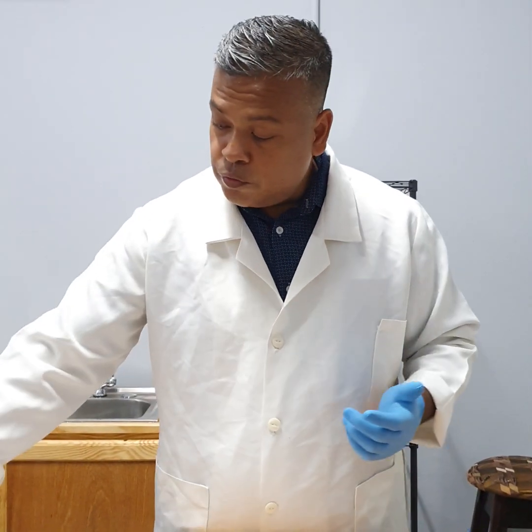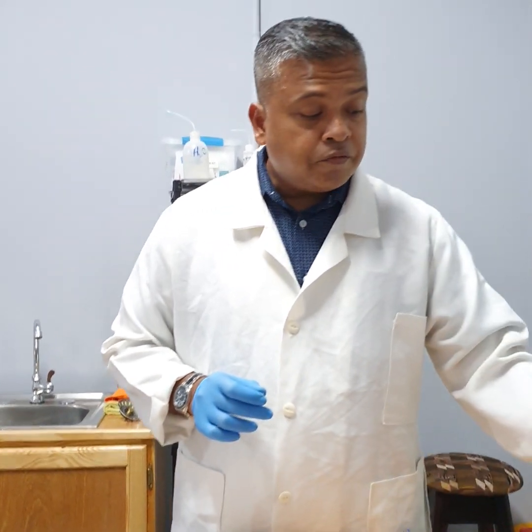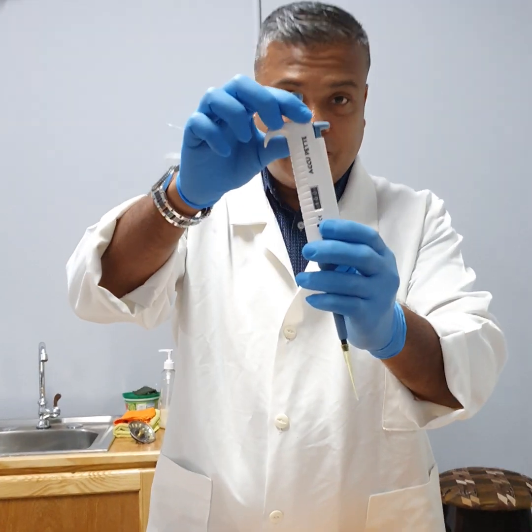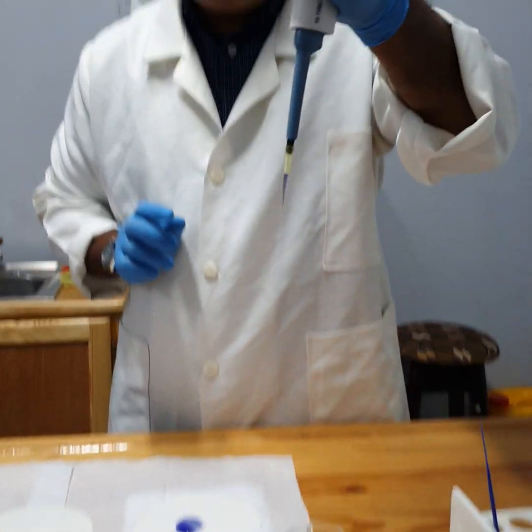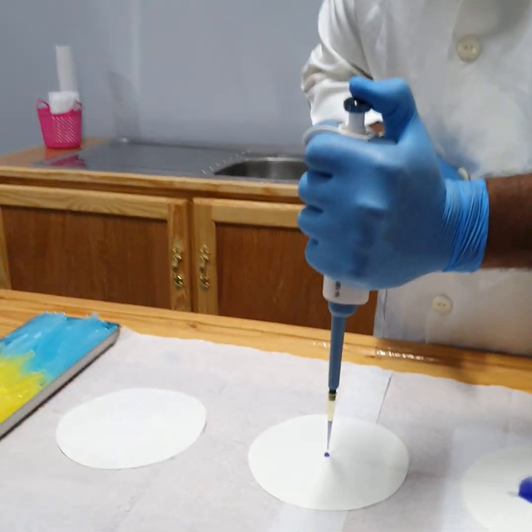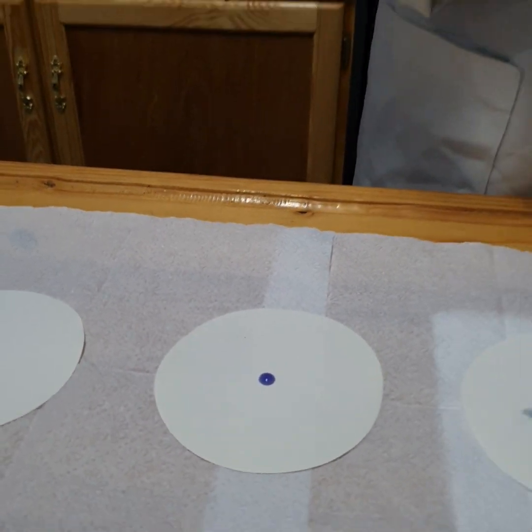What I want to show you here now is another analytical pipette with a particular range, which is smaller, 10 to 100 microliter. Now I'm going to show you what 100 microliter looks like. This is 100 microliter, which is 1/10 of a milliliter. That is what 100 microliter looks like.